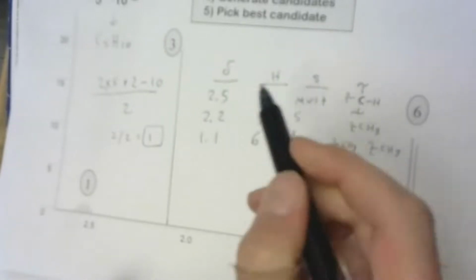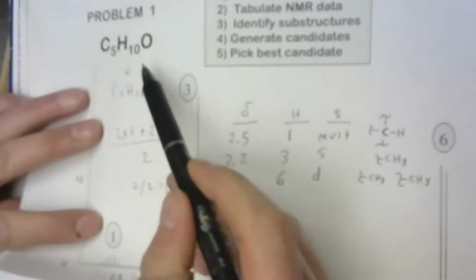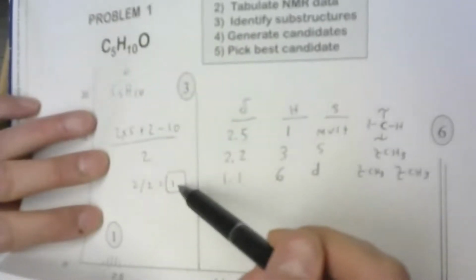And both of them have a squiggly. Okay, we cool? So that's how we kind of started this. We made some pieces. Those are all pieces of the puzzle, right? Does this add up to C5H10O? Because we need C5H10O. We haven't addressed the UN yet.